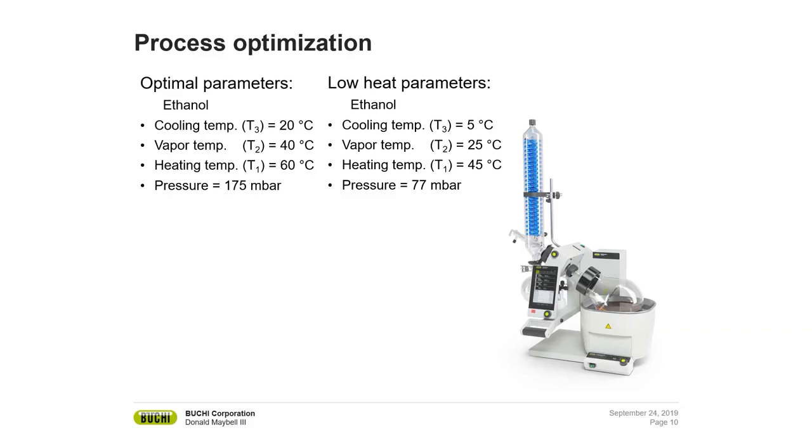Now these are two very good examples, especially to get your process started. Depending on how powerful your chiller is, you can go lower on the cooling temperature, but I'll get into that a little bit later. But in the case that you want to optimize outside of the Delta 20 rule, that is also possible. But it's very important to pay attention to the cooling capacity of your condenser, and then make sure not to bump the sample into the condenser area and all over your flask.